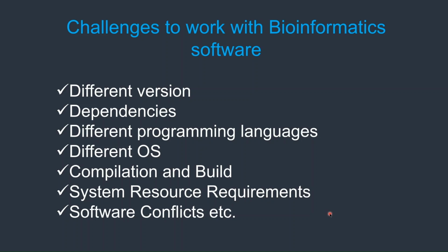In general, almost all bioinformatics tools have a README file or a user instruction. So to install a bioinformatics software or to use it properly, we should read those documentation carefully.